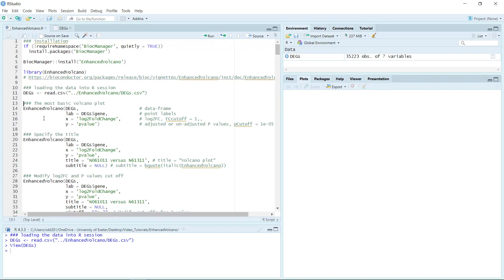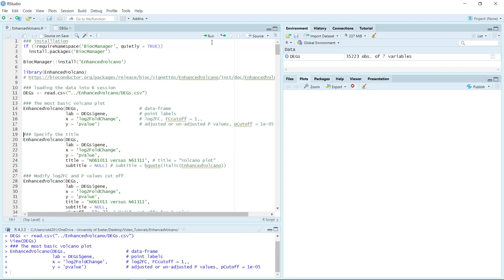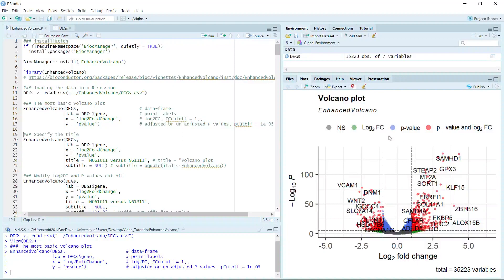You can see here we are going to use the EnhancedVolcano function. The data will be 'degs', the label argument will be the gene column, the x-axis will be log2 fold changes, and the y-axis will be the p-values. We are using all the default settings. After running, you can see we generated the plot. The default fold change cutoff is 1 and the default p-value cutoff is 10 to the minus 5, so the line appears at 5 on the y-axis.